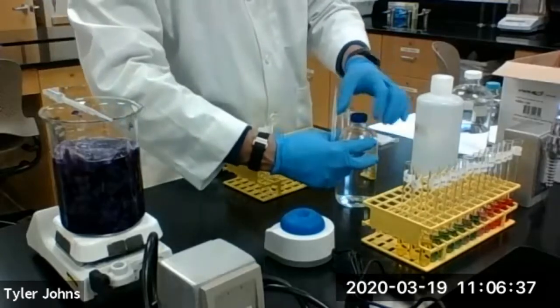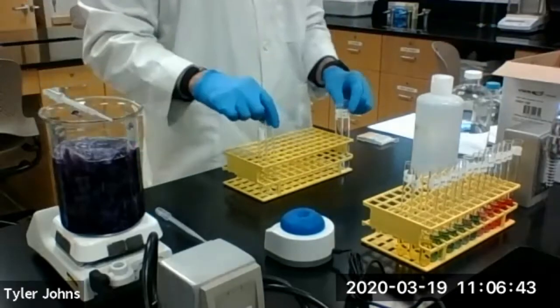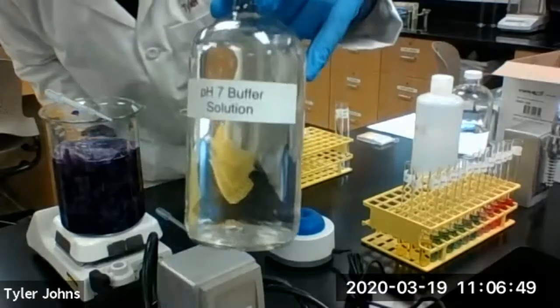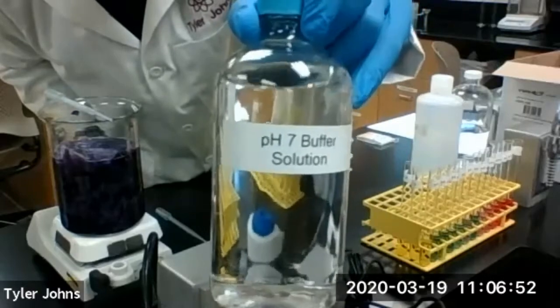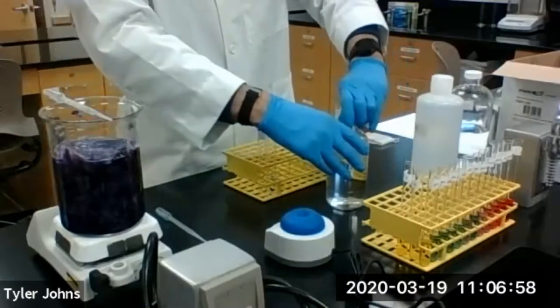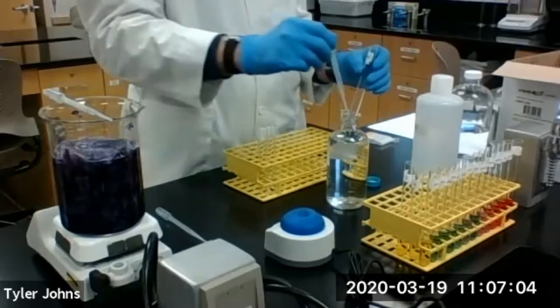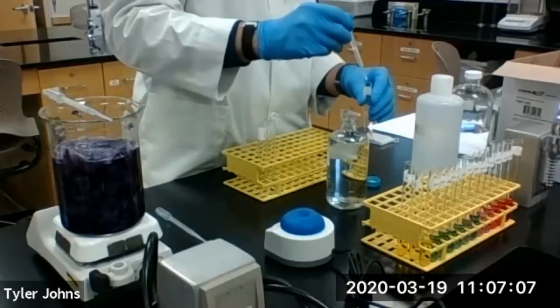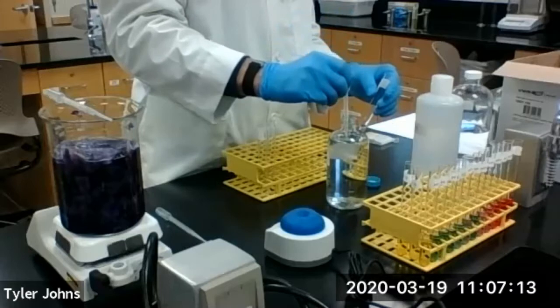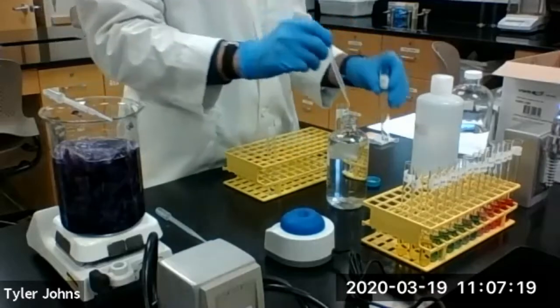Okay. So we've aliquoted deionized water into 2 test tubes. We're now going to aliquot out 5 milliliters of pH 7 buffer solution. So this is a buffer. The deionized water is not buffered. So we're going to aliquot out 5 milliliters of this into 2 test tubes, the pH 7 buffer. And our second test tube.